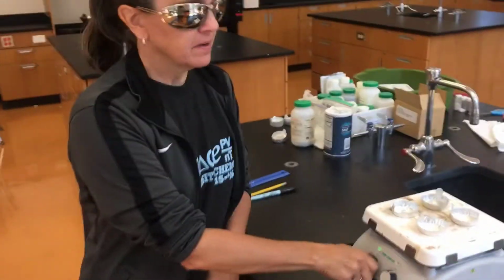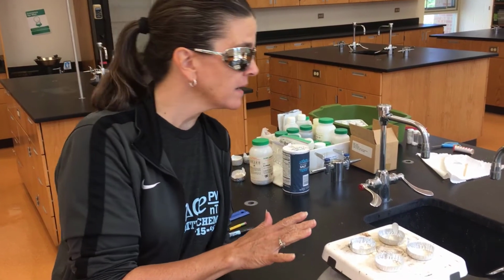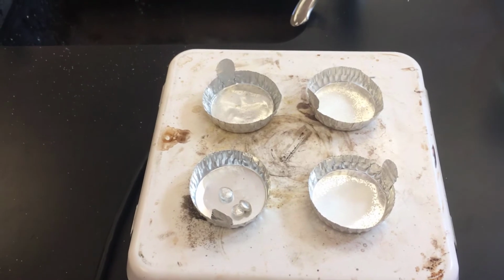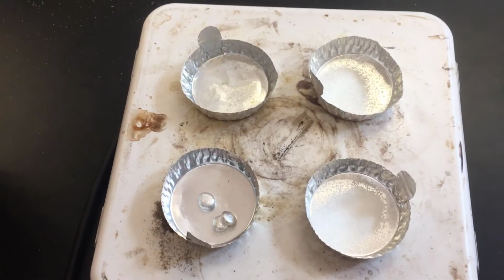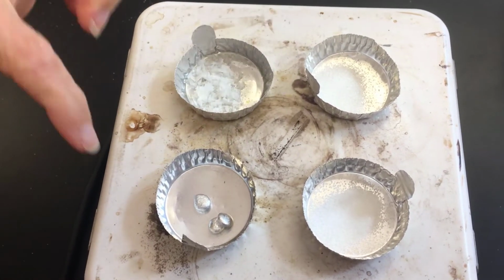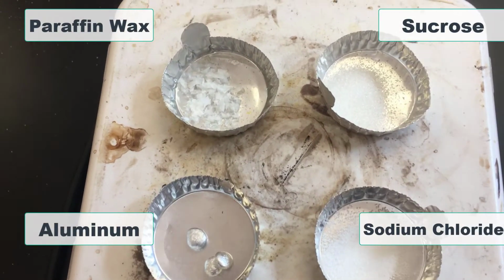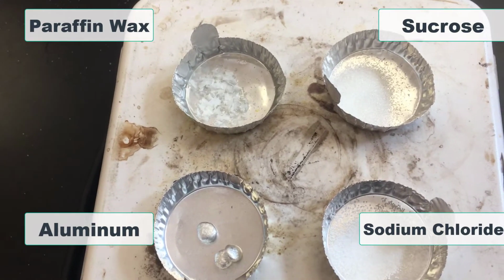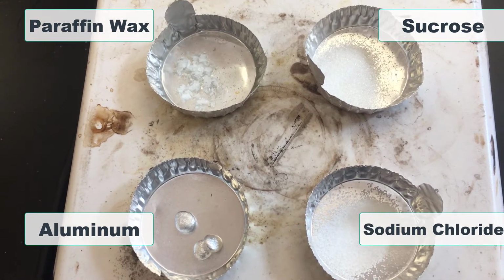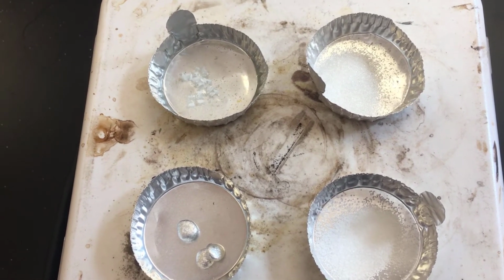Okay, so now we're going to run a relative melting temperature test. Now, we're not using any thermometers here, so I'm not actually going to be getting specific temperatures. We're just going to be figuring out which thing melts most quickly. And this one here is my paraffin. This one is my sucrose. This is my aluminum. And this is the table salt or sodium chloride. And you can see while we're watching that the paraffin is clearly melting very rapidly. Of course, they're all under the same basic heat. So clearly the paraffin has the lowest melting temperature, and we're waiting to see changes in any of the other ones.